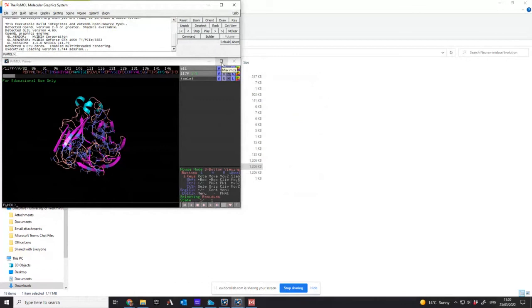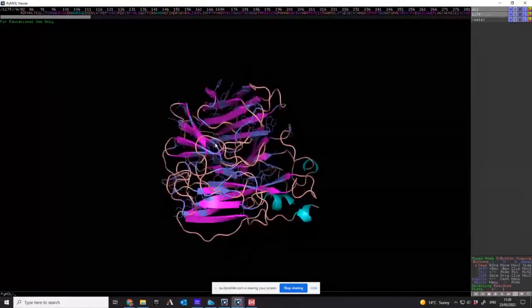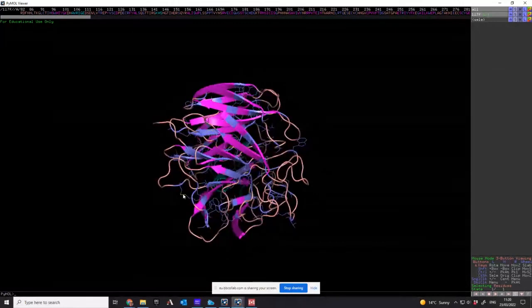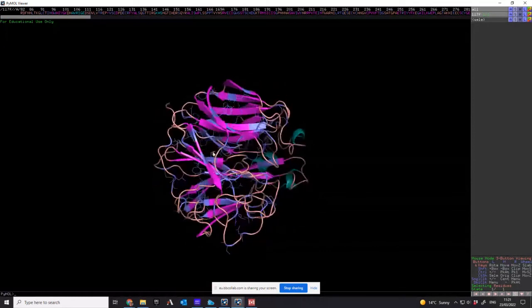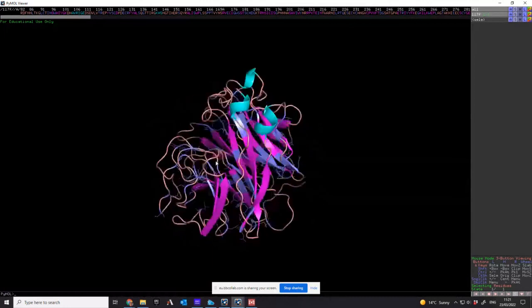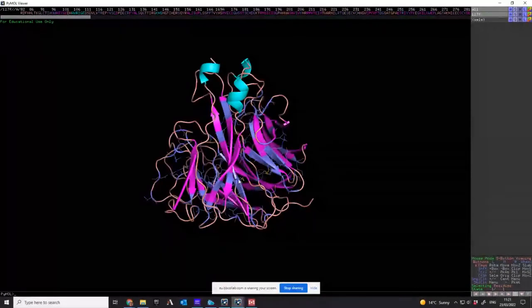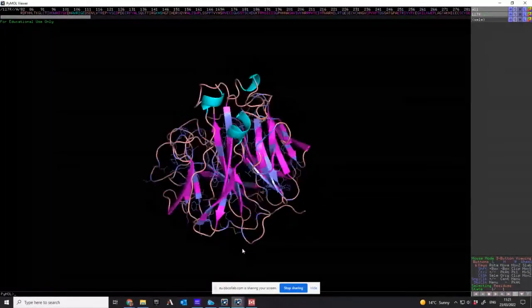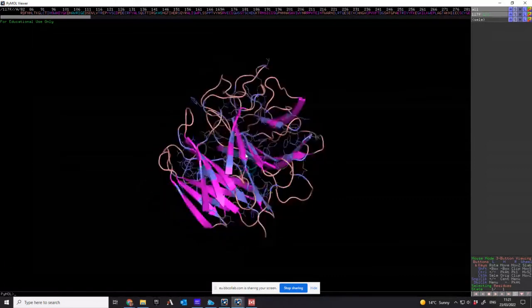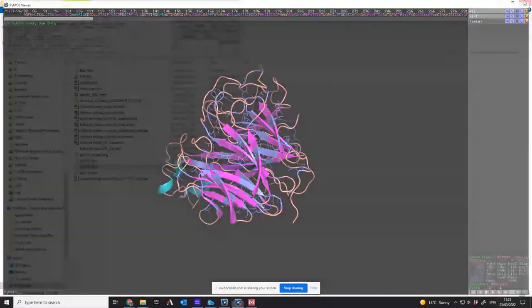Oh, same thing, different color scheme. That's my better purple one where I'm showing. So you see here, there's another disulfide bridge. There's another disulfide bridge. You can see 3 here in the same place. So all of these disulfide bridges are important to the structure of the protein. So evolution cannot change them. These are fixed things that are important for the protein to stay folded together.